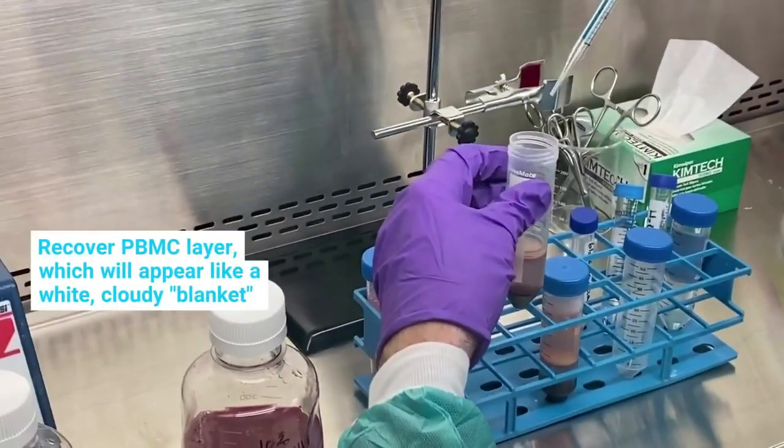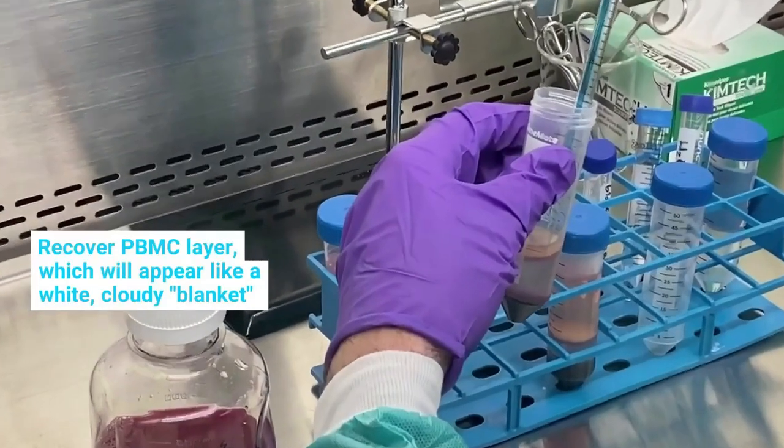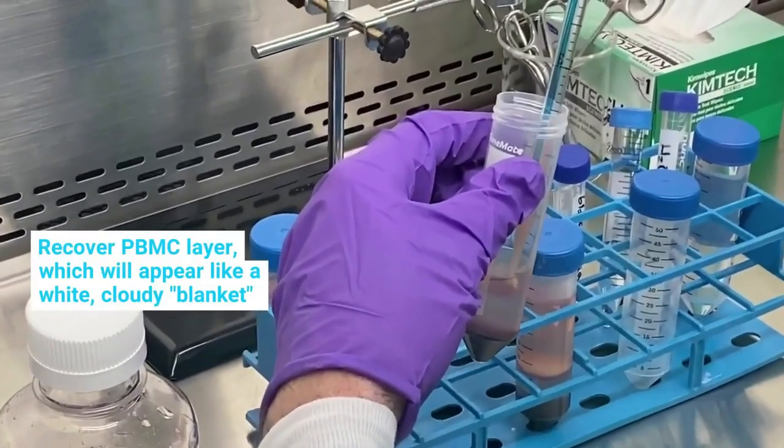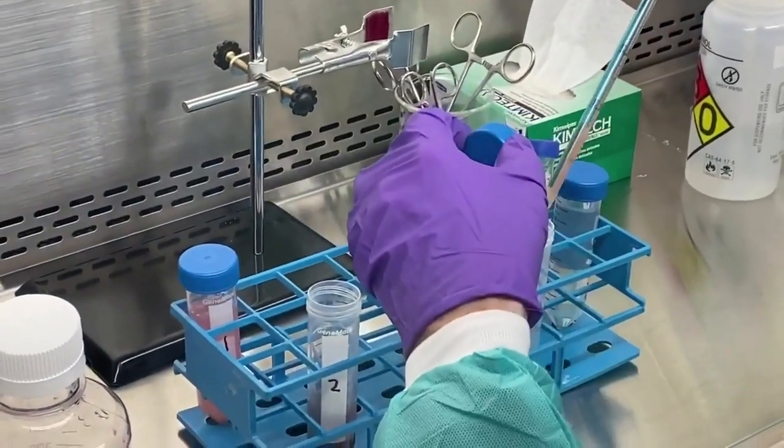The layer of PBMCs will appear like a white and cloudy blanket. When recovering the PBMCs, take care not to withdraw too much of the layer below, containing the density gradient, granulocytes, and RBCs.